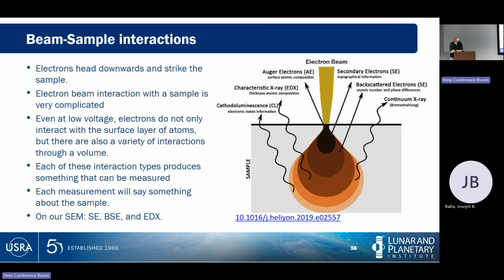Okay, so we've covered thus far just the mechanics of what an SEM is and what it's trying to do when we're creating a beam. The next section is: I put a sample in. What actually happens in my sample when I hit a piece of material with an electron beam? I do a whole bunch of different things, and there are 6 different responses listed here. There are other ones that you can certainly come up with if you're being creative.